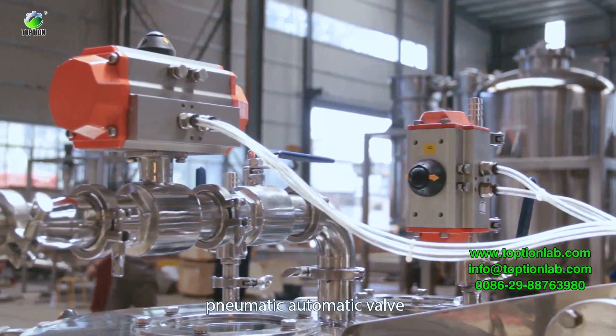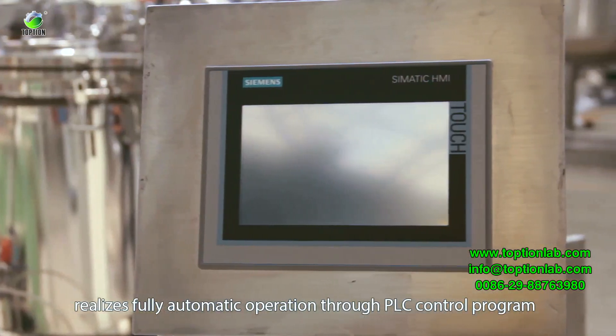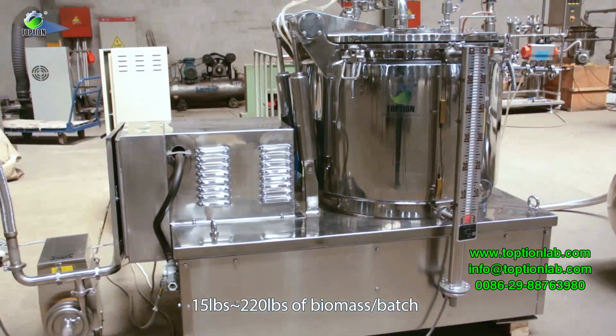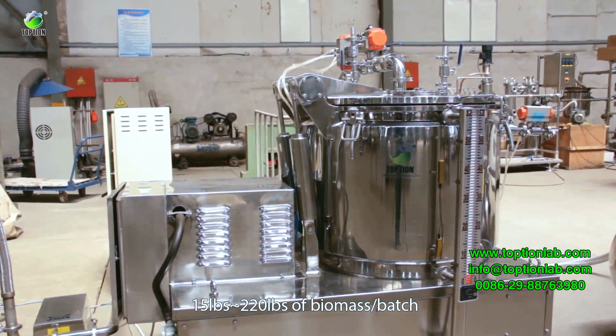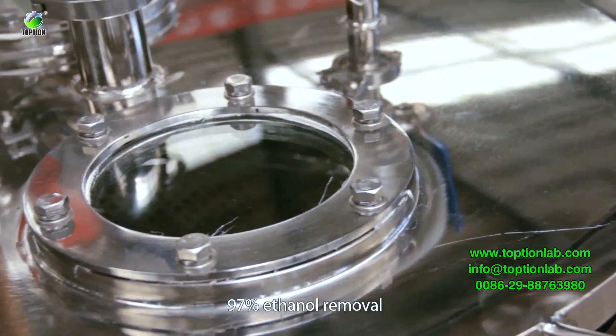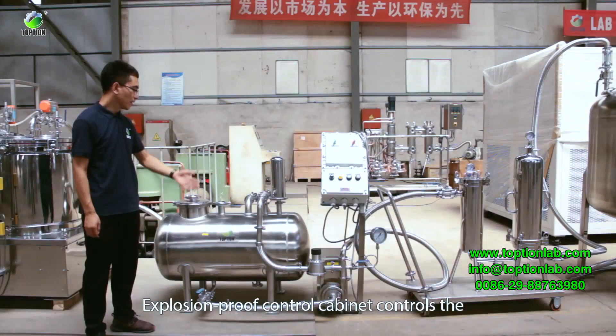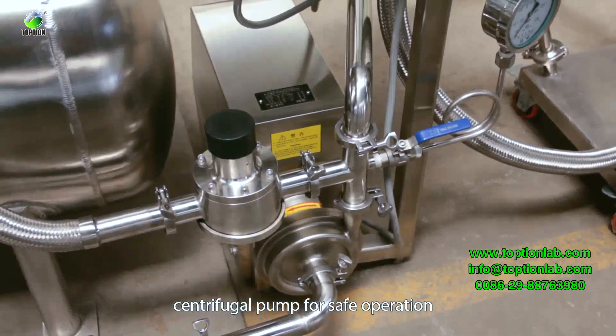Pneumatic automatic valves realize fully automatic operation through a PLC control program. The system handles 15 to 220 pounds of biomass per batch, achieving a 98% extraction rate from biomass and 97% ethanol removal. The explosion-proof control cabinet controls the centrifugal pump for safe operation.